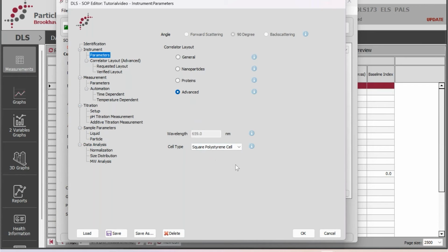It is important to be careful to choose the correct cell type for your sample. Using the wrong sample cell can severely damage your instrument due to chemical compatibility issues. For example, harsh solvents can melt or deform plastic. Also keep in mind that high temperature will also melt plastic. Extracting a melted plastic cuvette from a sample holder requires disassembly and potentially realignment of the instrument.